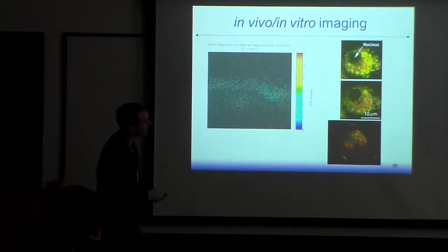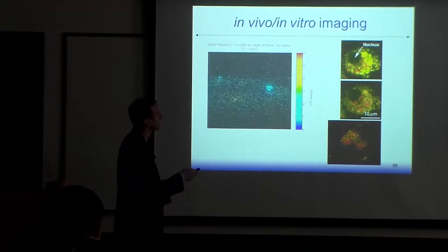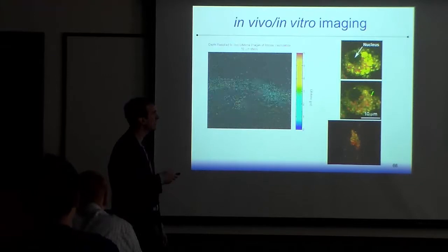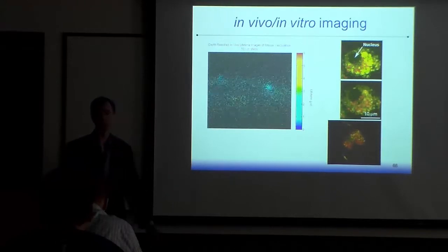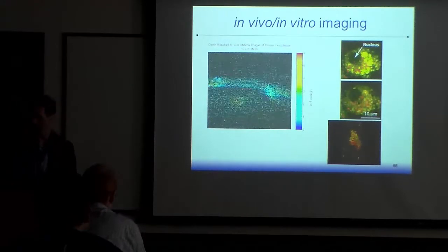And here's an experiment. The resolution is not so great here, but each of these is one of our probes. The red ones are the oxygen sensing probes, and the green ones are hydrogen sulfide sensing probes. We put hydrogen sulfide into the cell culture medium, and you can see the decrease in intensity of the yellow, which is the hydrogen sulfide, while oxygen stays as bright as it was before. This shows the selectivity of these probes.